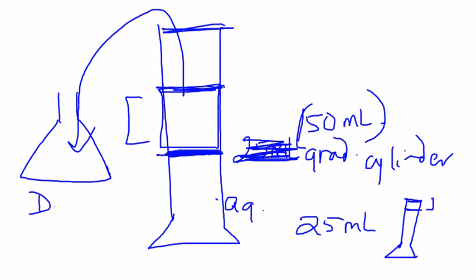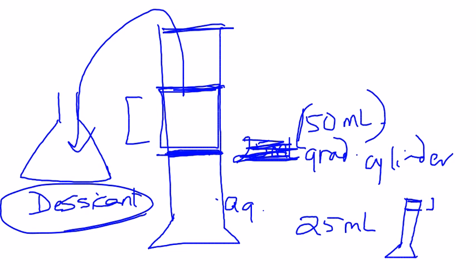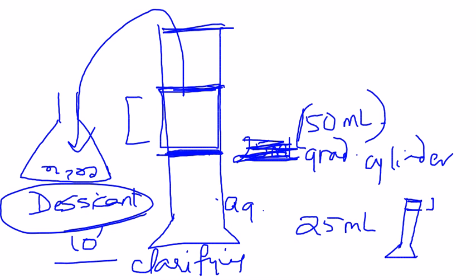You will then add the desiccant. The desiccant is basically to remove any moisture, because we had added an aqueous solution of sodium carbonate. Just swirl it gently and allow it to sit at room temperature for 10 minutes. At this point of time, you should see clarification, like your murky, turbid, cloudy solution should kind of clear up a little bit. And then you should also see that the magnesium sulfate, or the desiccant that you had put in, stays at the bottom, but a little bit of it moves as you gently swirl.